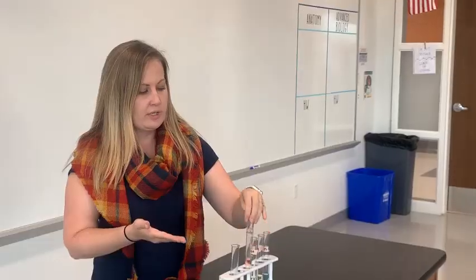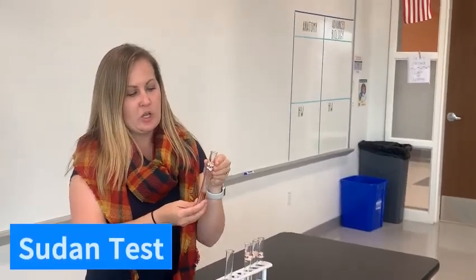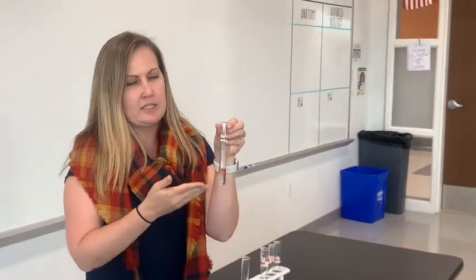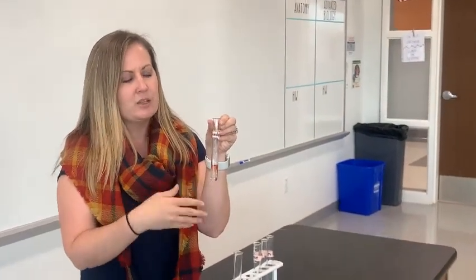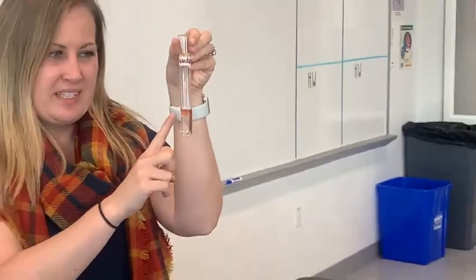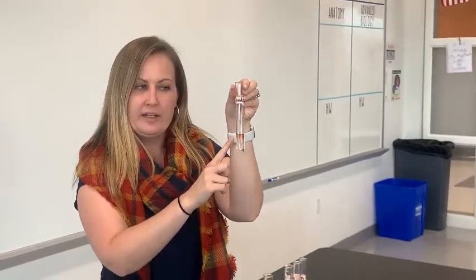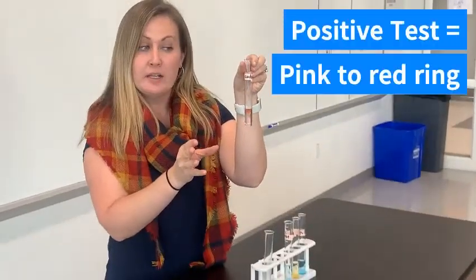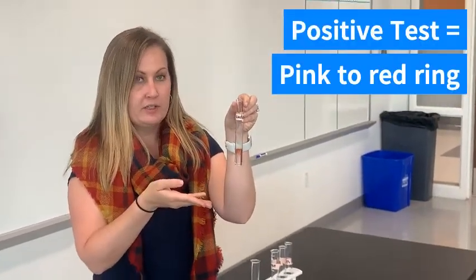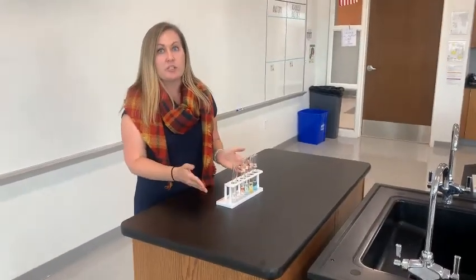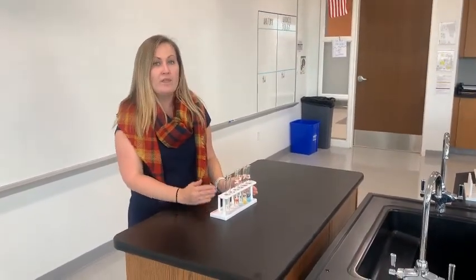The last one is the Sudan test. The Sudan test is one of the trickiest ones — it looks for the presence of lipids. Right now you can see it's a very light red, almost a pink. When this turns to a dark red, we can say that lipids are present. We saw no change in any of our water samples because we're using water as our control, and that's what we're going to compare all of our samples to.